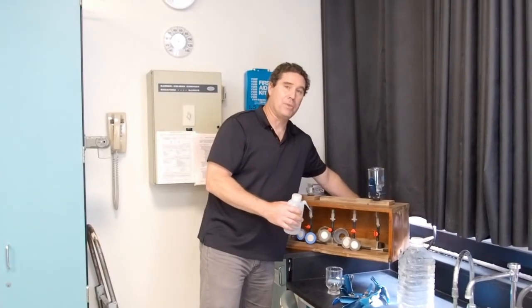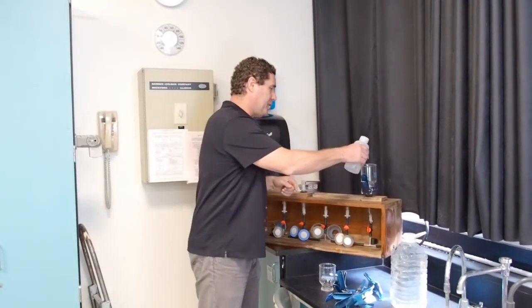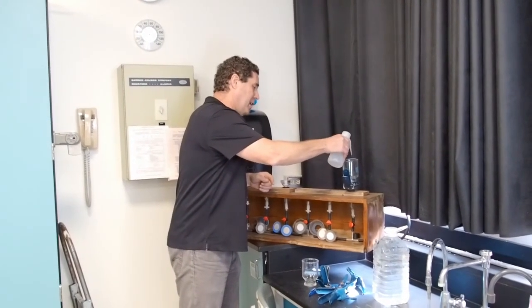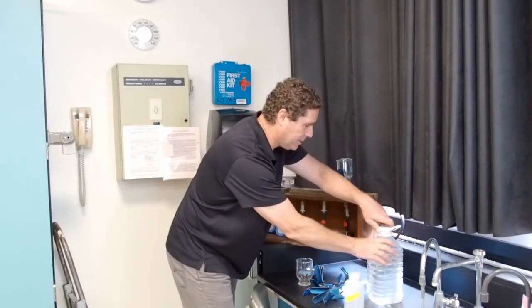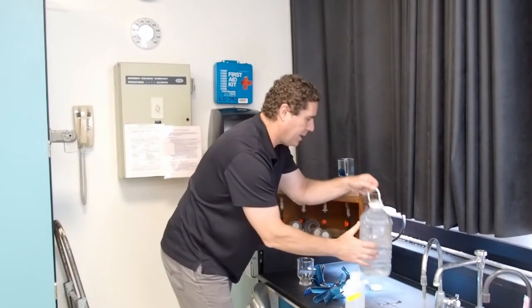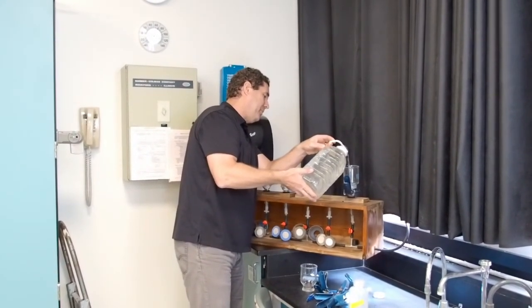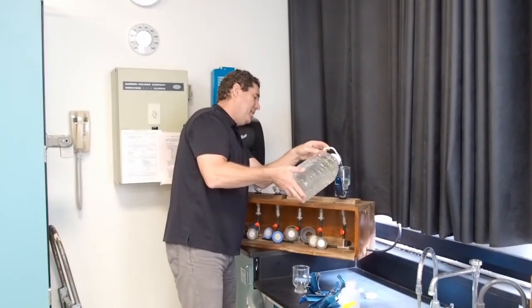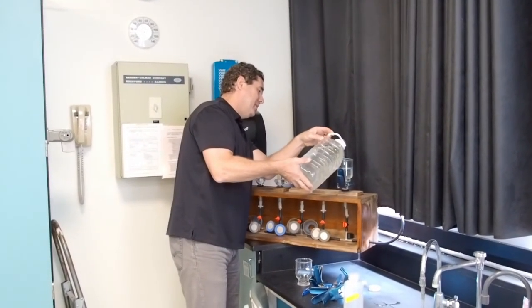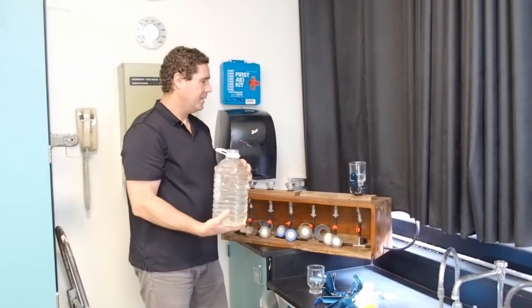And now our vacuum is running here, so the air is being sucked through the filter and down in this direction. I'm going to put a little deionized water in there to start this going. And then we're simply going to take our water sample and pour it into this cup, a little bit at a time, and then let it be sucked down through the filter.